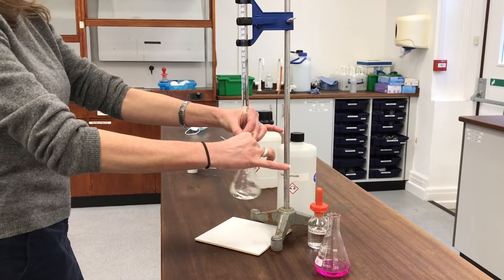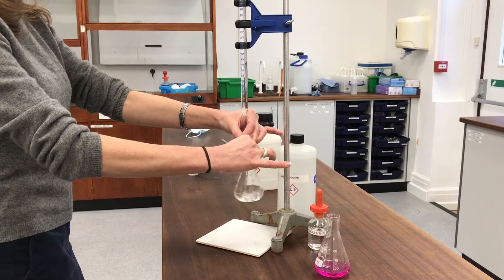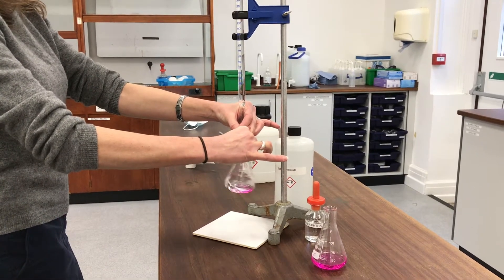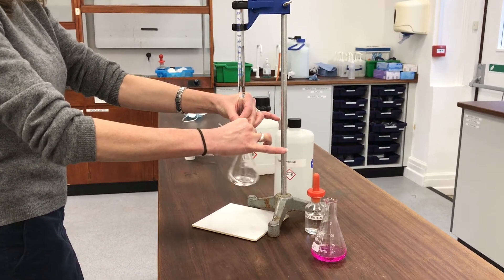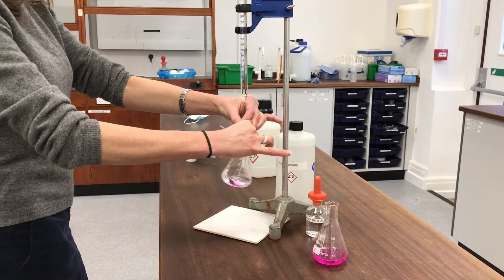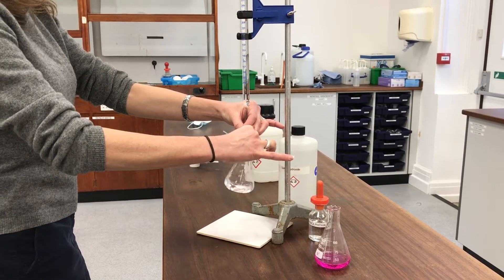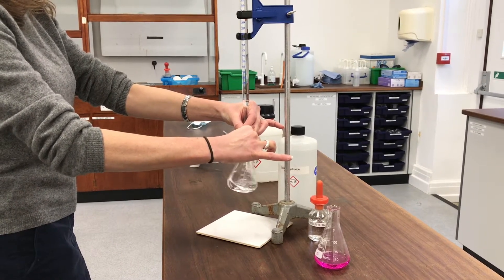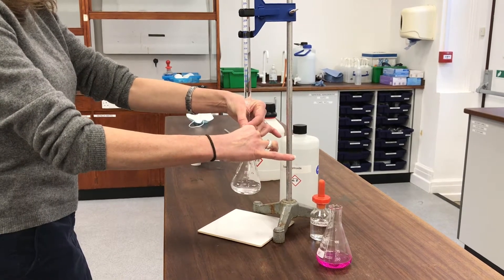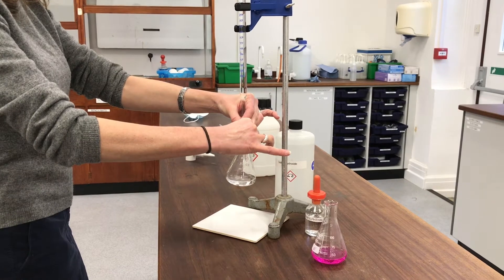You can see that the pink colour of the phenolphthalein is showing each time the drop of alkali hits the solution, and as I'm swirling it, it's having time to react with any acid in there that hasn't reacted yet and remove the pink colour. I'm looking for that lasting pink. I think it's pretty close there.